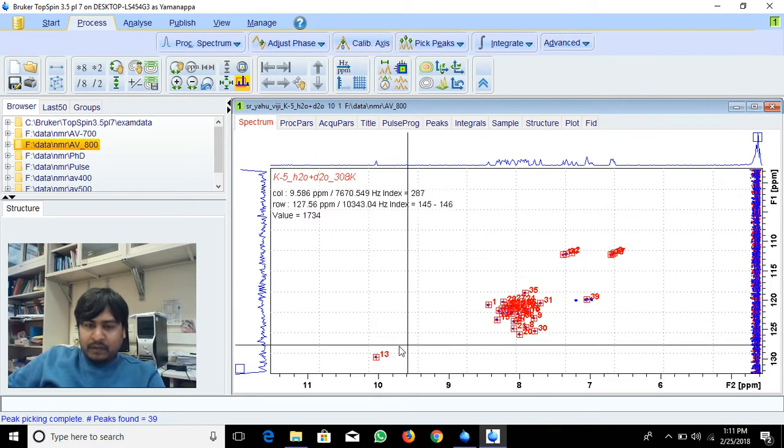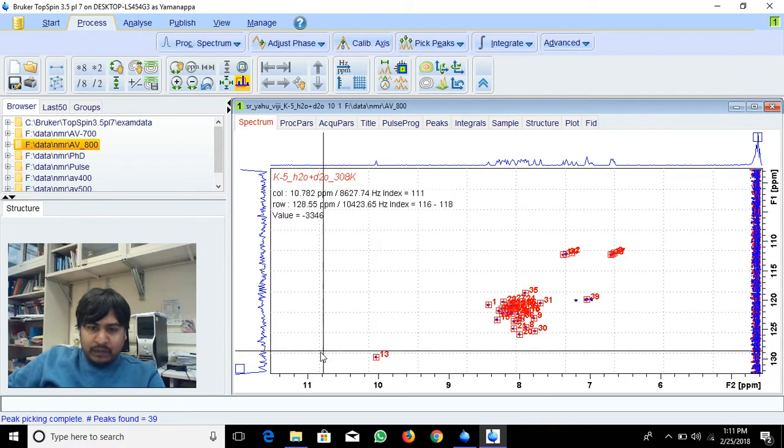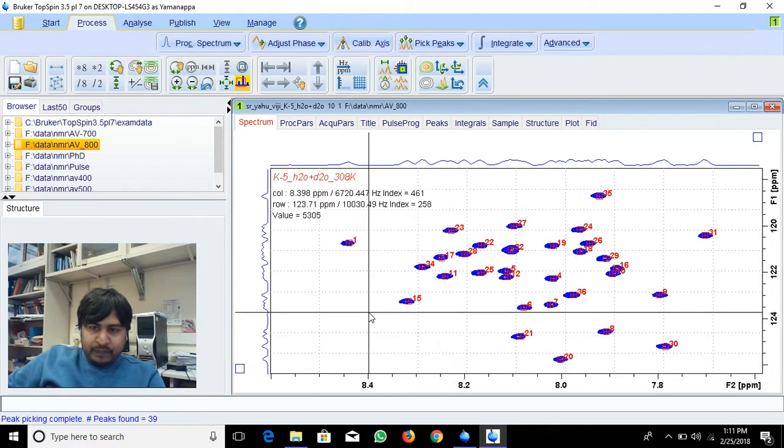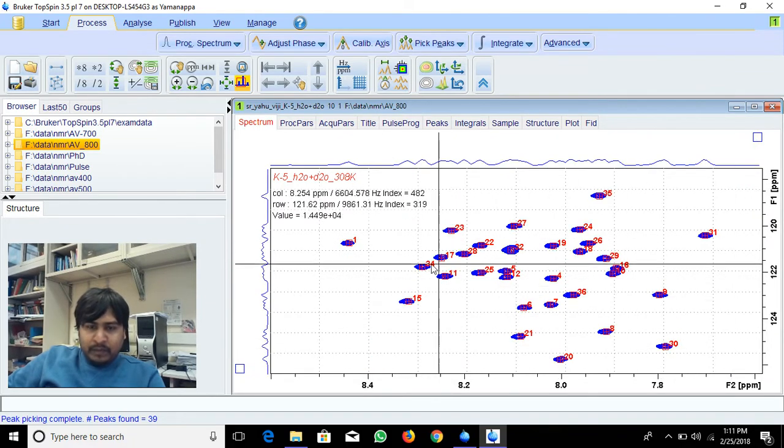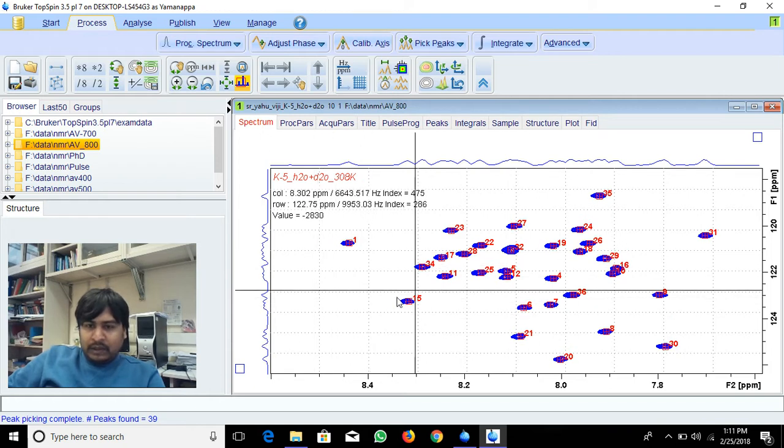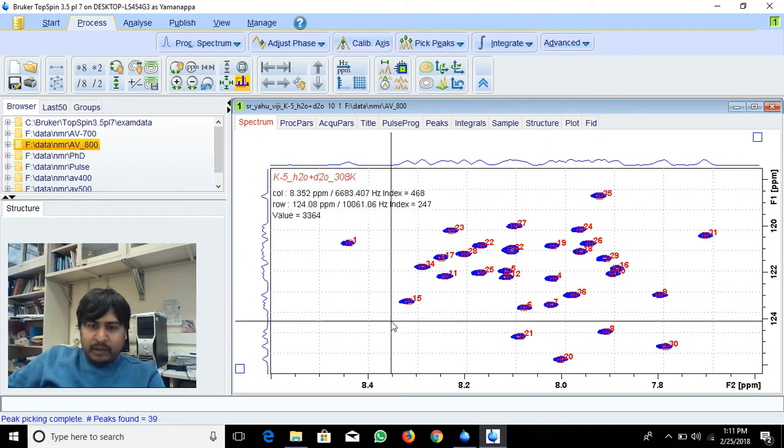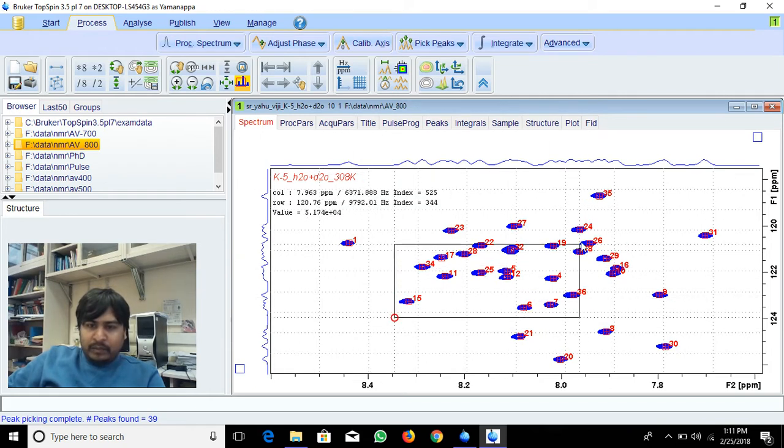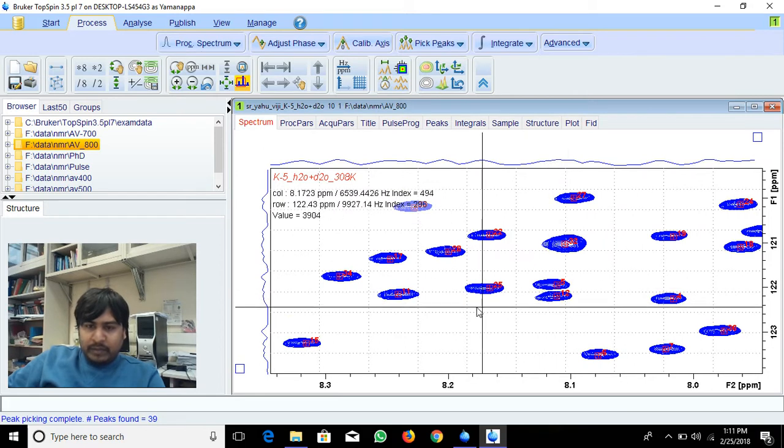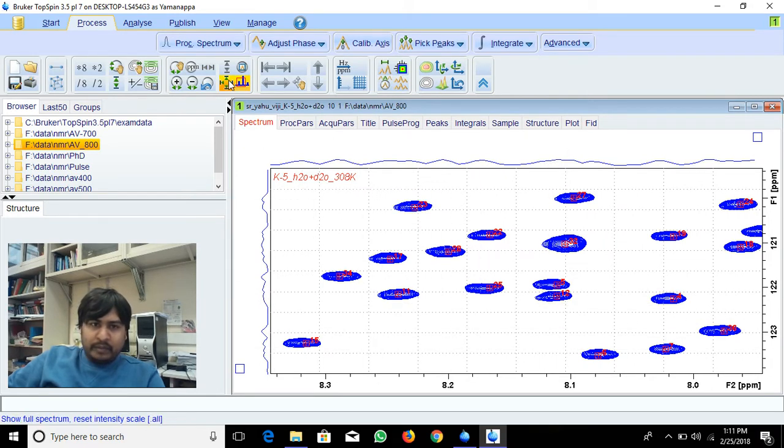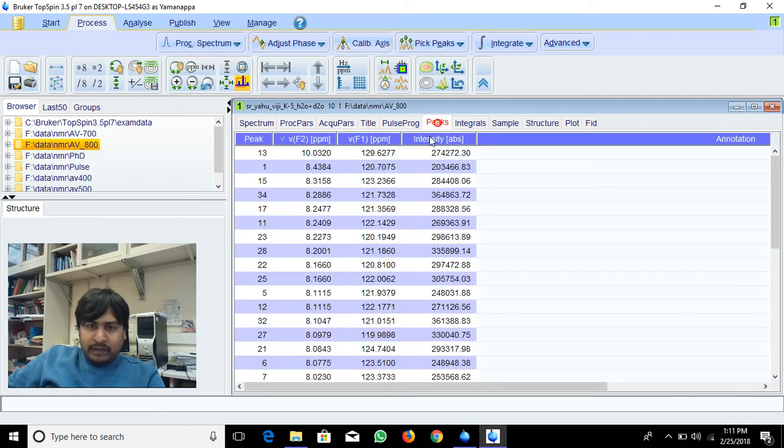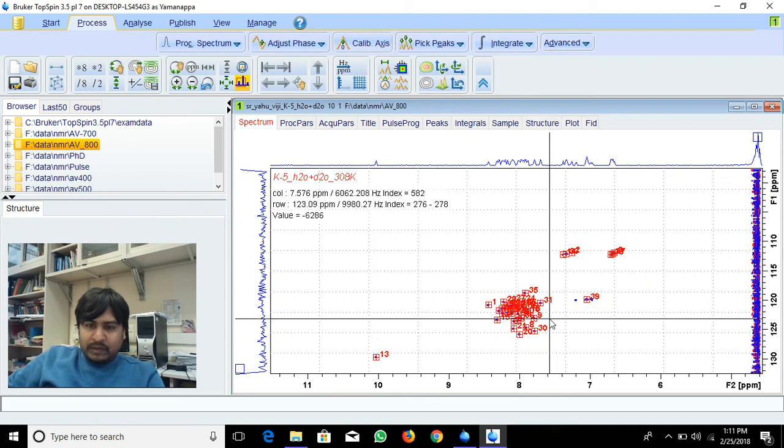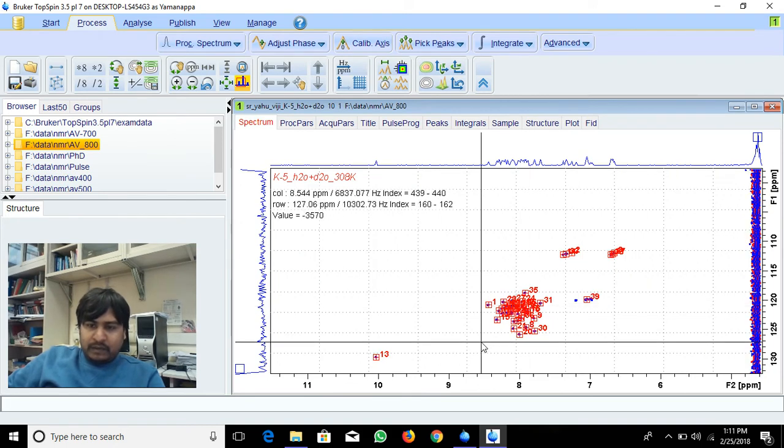It's picked almost all peaks. If it's not picking some, you have to select that peak and pick manually. Some overlapping peaks it will not pick. You can see it's picked all the peaks, and you'll get those peaks and intensities from which chemical shifts. In two-dimensional experiments you can do this by view or PP for manual peak picking.